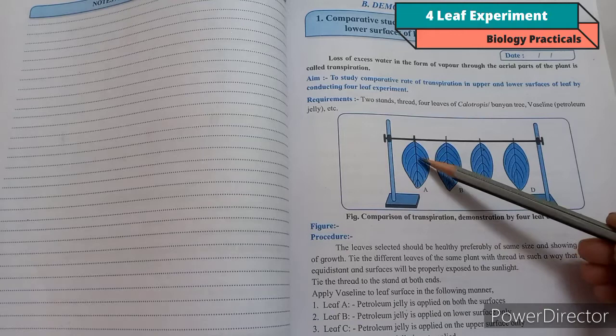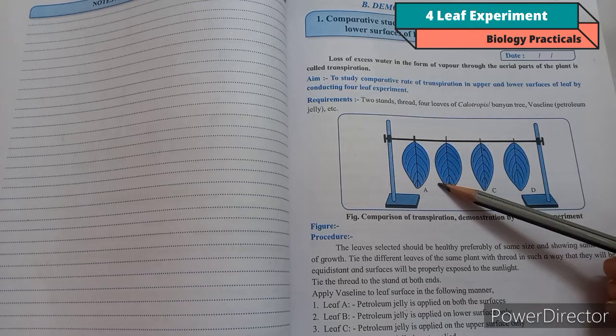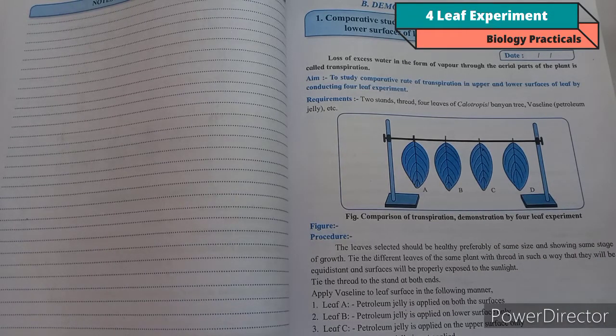If you see the surface of the leaf, tiny openings are present on the epidermis, and we can see these stomata under a light microscope. Stomata, which are found on the surface of the leaf, play a very important role in gaseous exchange and photosynthesis. Stomata also control transpiration rate by opening and closing.